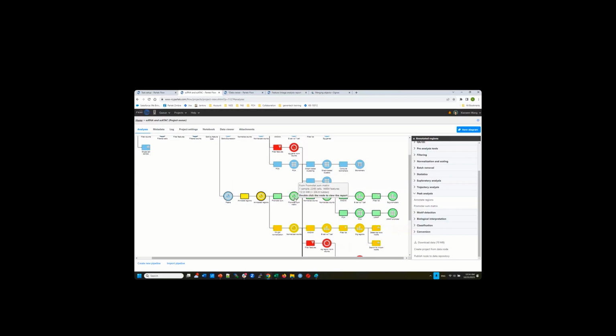Actually, it's a gene, but this is not gene expression. We just use the gene name to help you identify it. You look at the read count at the promoter of the genes. So the downstream analysis is very much the same. You can think of this as a gene, but the measurement is only the promoter region. From that, we can use a similar single-cell RNA-seq pipeline. We perform PCA and UMAP, so I get another UMAP, which I call the promoter UMAP.